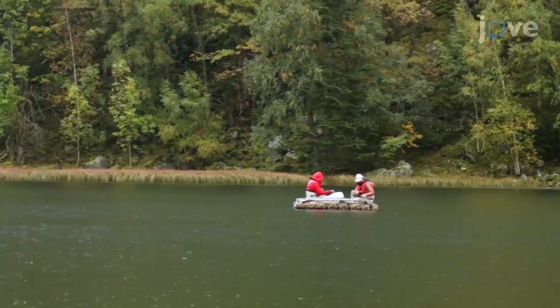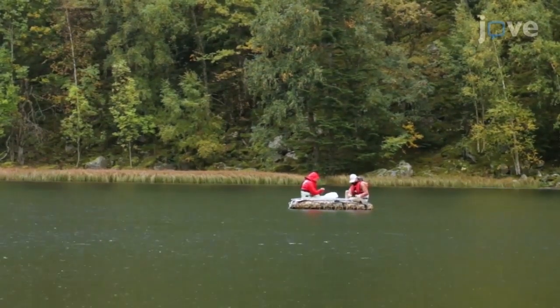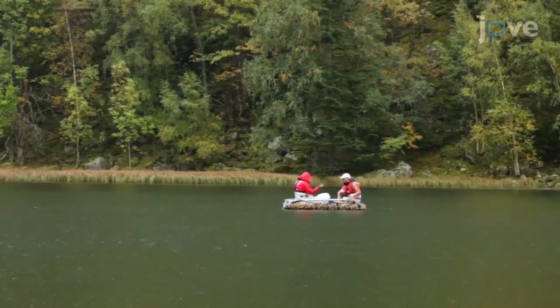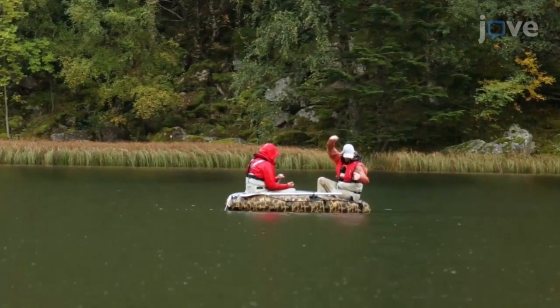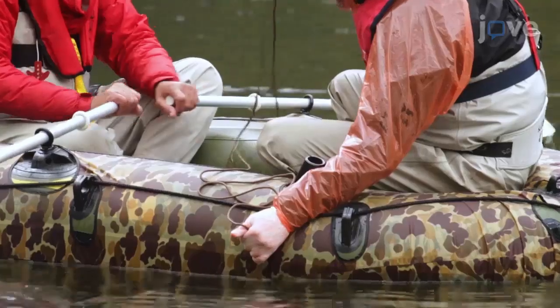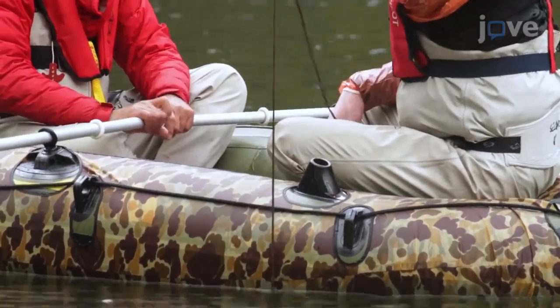Stabilize the sampling equipment for 60 seconds to ensure the correct sediment penetration and recovery of a scarcely disturbed sediment core. Release approximately 1 meter more rope so that the sampling tube penetrates the sediment. Be aware that if the sampling tube penetrates too much, it can disturb the water-sediment interface.